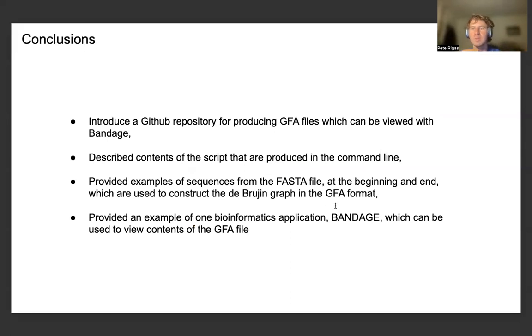And we used simpler sequences just to make this script be able to compile within a reasonable runtime from the beginning to the end, which are used to construct the de Bruijn graph in the GFA format, as well as we provided and drew the viewer's attention to one potential bioinformatics pipeline or application, Bandage, which can be used to view the contents of the GFA file.